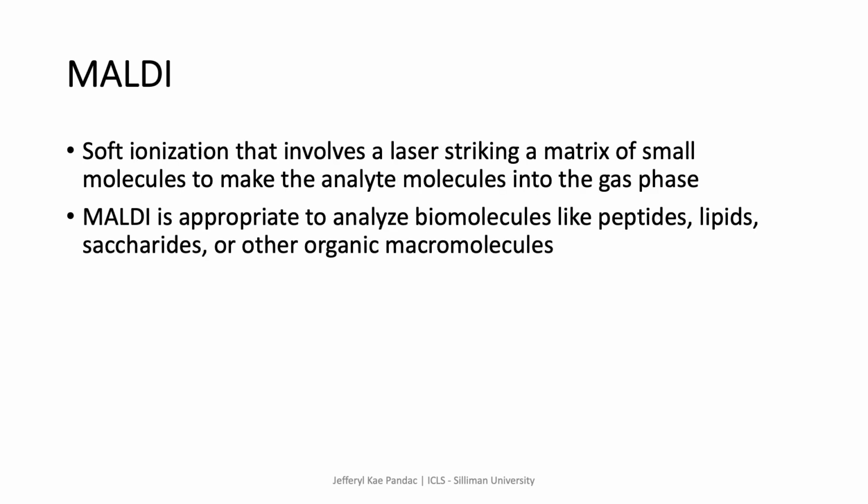MALDI is a soft ionization that involves a laser striking a matrix of small molecules to make the analyte molecules into the gas phase without fragmenting or decomposing them. Some biomolecules are too large and can decompose when heated, and traditional techniques will fragment or destroy these macromolecules. So MALDI is appropriate to analyze biomolecules like peptides, lipids, saccharides, or other organic macromolecules.